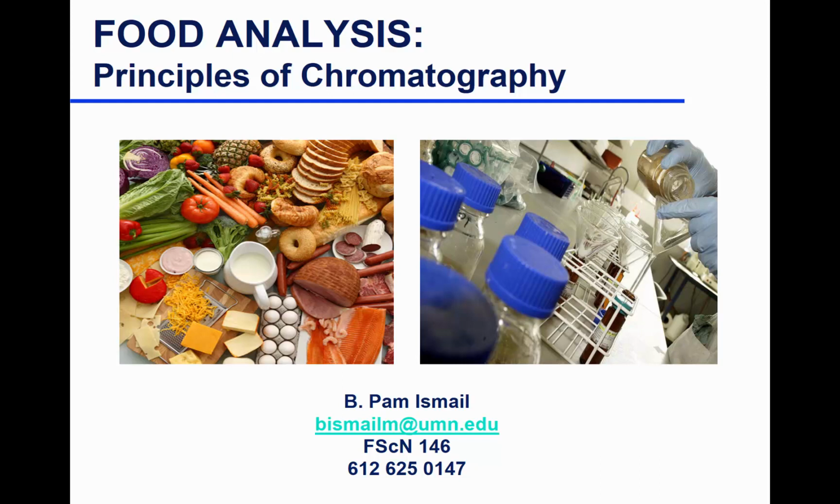Okay, the origin of the word has to do with colors, because chroma. Taking a guess, I think it's separating solvents by their polarity in some cases. Solutes, yes, separating solutes. Solvents is what you use to separate them. Yes, you're very, very close. And sometimes it's by polarity, sometimes it's by something else.